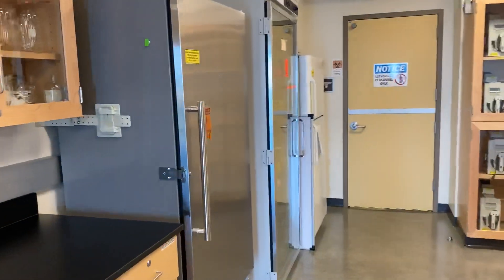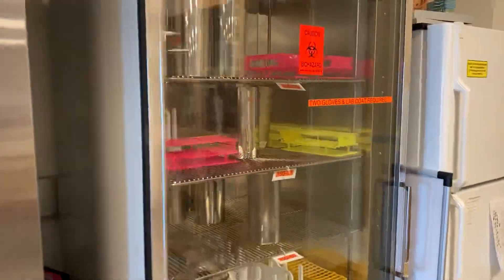Our incubators — which is where we'll be maintaining our cultures.